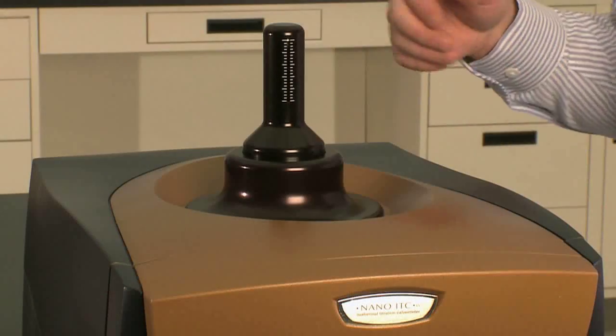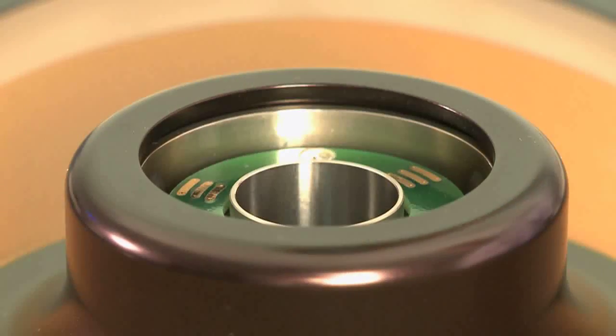In this TA Tech Tip, we're going to be filling the sample and reference cells of the nano ITC. The first step is to remove the burette handle from the ITC.